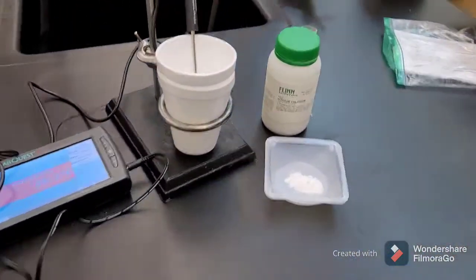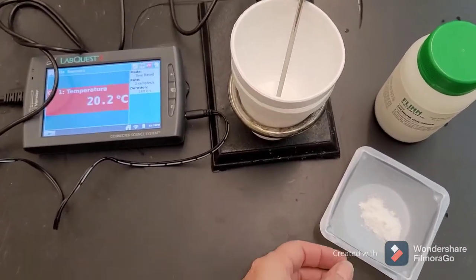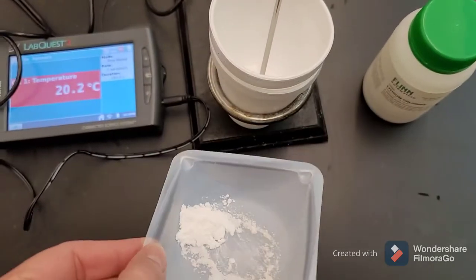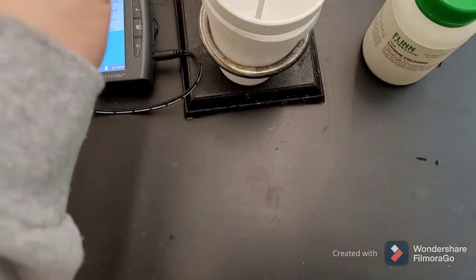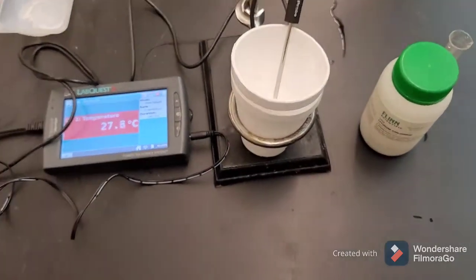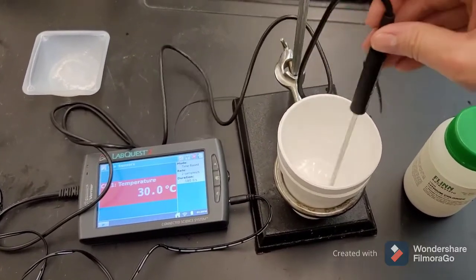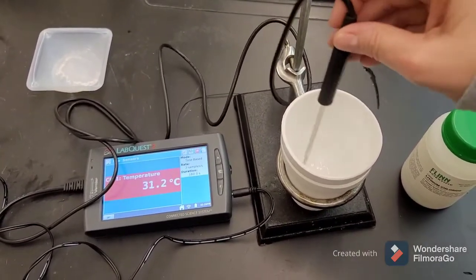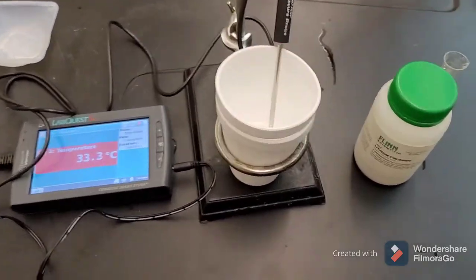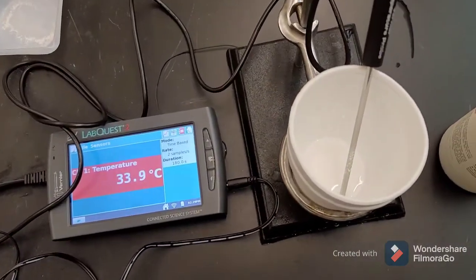All right, so this is lithium chloride. The temperature of my water is 20.2 degrees to start. Lithium chloride is more powdery. It's not as crystalline as the other one. So I'm going to put it in there, and I'm going to stir with the thermometer, which you should never do in chemistry, but we are. And you can see what's happening to the temperature right away. Temperature is going up. Okay, so again, this is lithium chloride, and our temperature is going up.